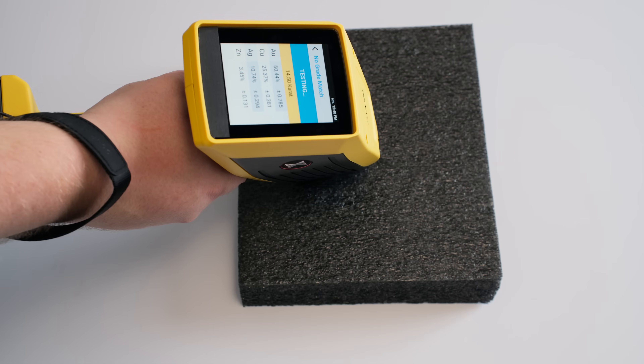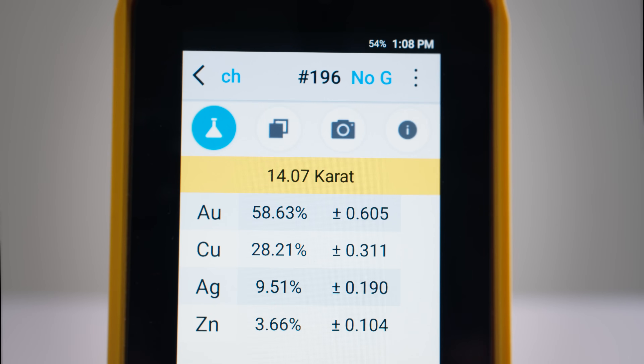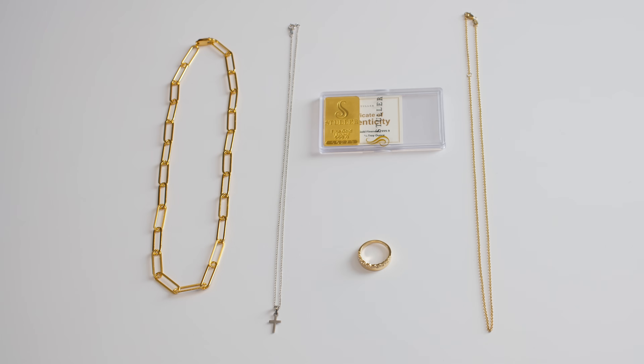And just like that, we can see that this is indeed gold. The display shows the exact metal composition — very cool. Let's take a look at results from a range of items so you can get an idea of what you'll see.